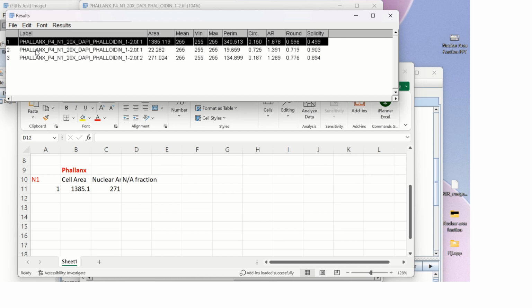CSV. So you want to save it. You're going to turn in all of these tables to me because that's my way of ensuring that you didn't just write random numbers on this Excel file and then turn that in. I need your raw data. Just like when you are a scientist, if you publish, you need to have all of these raw tables and everything ready to go. This is your data. If anyone requests it, you need to be able to send it out.